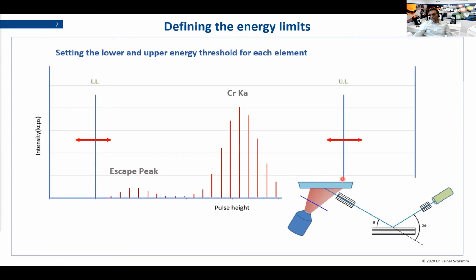And there are other cases where you would set the lower limit in the middle and you skip the escape peak. In the course we have on our platform, I will show you later on, there all these cases are described in detail and will help you to decide what case would be good for your application.